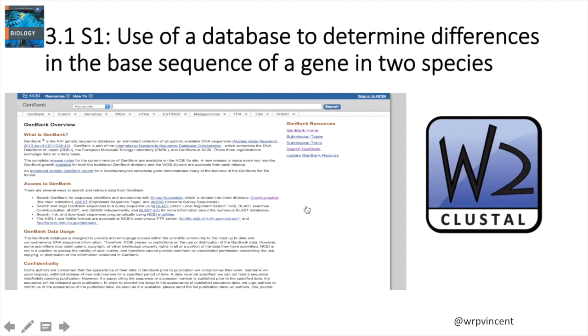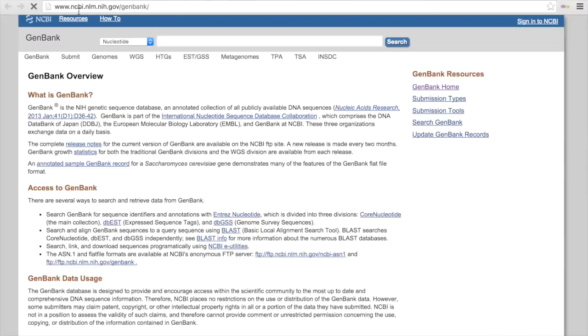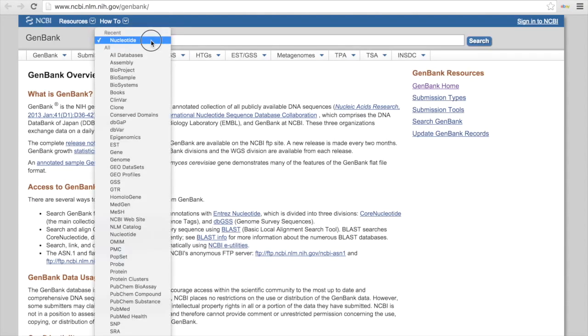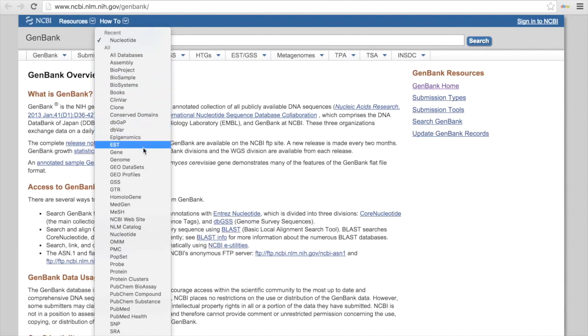Next step then is to go to the GenBank database, which you can Google. The link is given here at the top of my screen, and you'll get this landing page. We need to search for a gene, not a nucleotide. So I'm going to select this box, and I'm going to scroll down. I've got a whole list of things here we need not concern ourselves with right now. I'm just going to select Gene. So down to the search menu and select Gene.